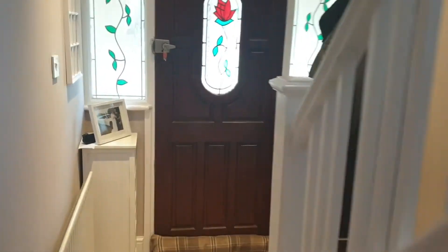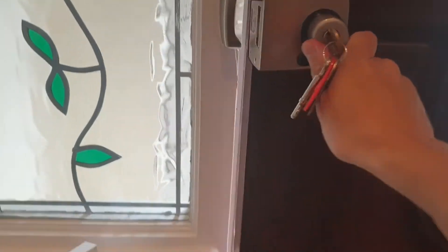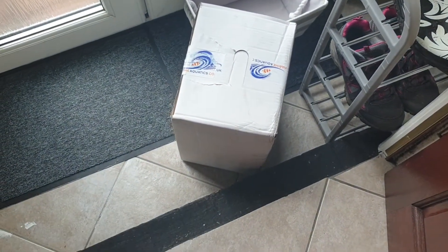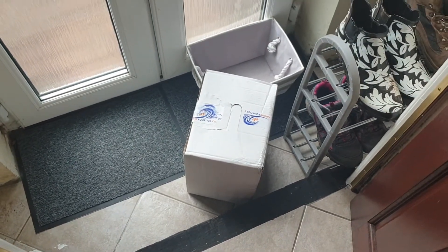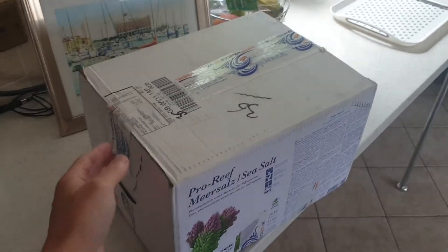I think with any luck this is our delivery for both the salt as well as the ICP test — yes it is! Here it is. We'll get this into the kitchen, get it unboxed, have a look at the ICP test, take the sample, and get it posted off this afternoon.